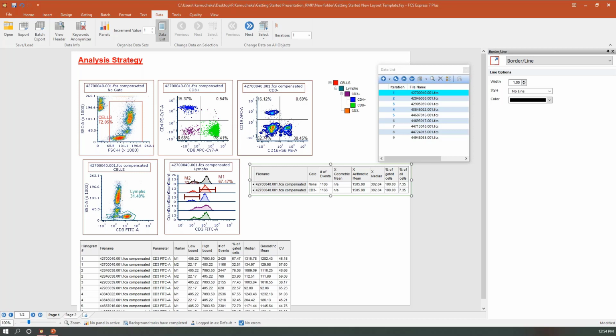So we can also, yes, we can do that in FCS Express. We have a great titration webinar that is a little more advanced than what I can show you in enough detail to really describe the process here, but if you would like, we can definitely connect with you outside of this webinar and schedule a one-on-one training and help you develop that fluorescence and concentration plot.